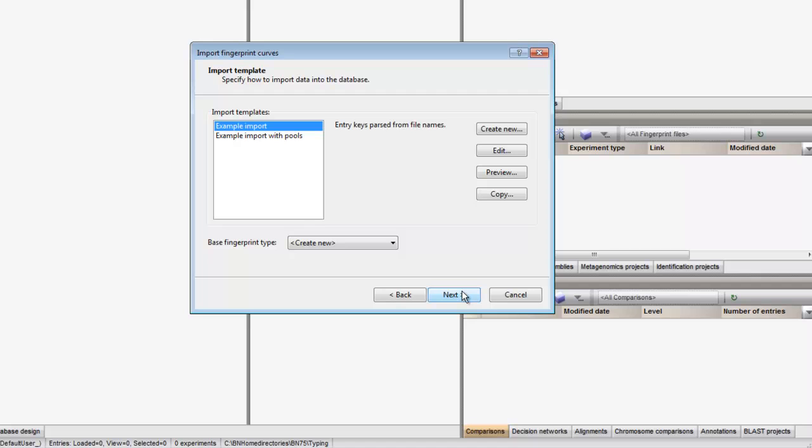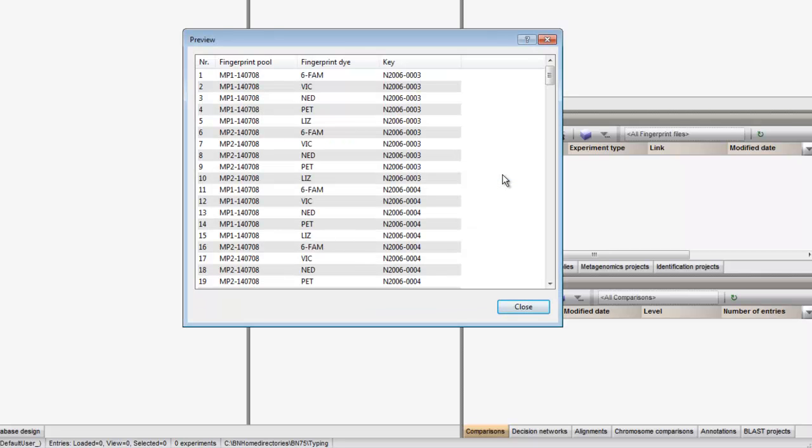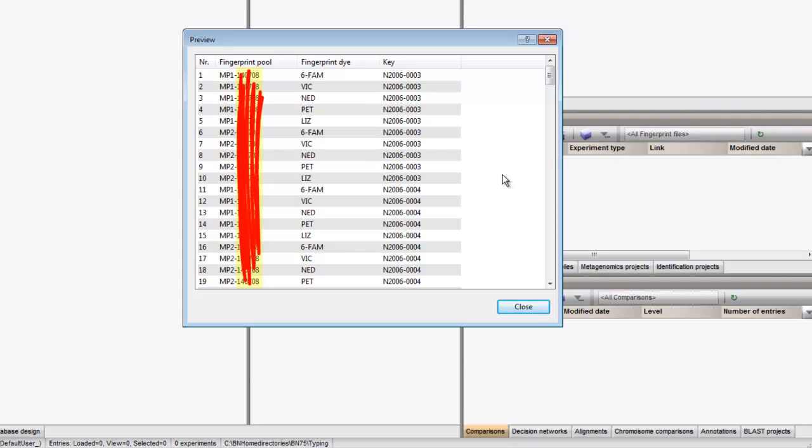For the present dataset, the key and pool information is provided within the file name of the curve files. Pressing the Preview button gives us an idea of how the data will be parsed. The parsed key is OK, but the pool name may be shorter. The number after the hyphen is not informative.